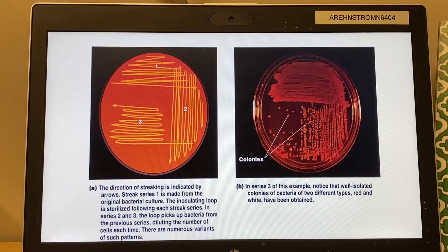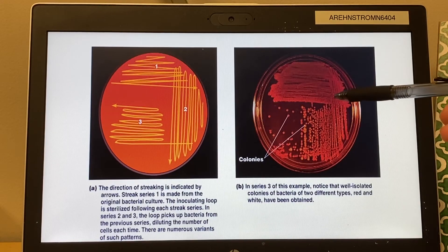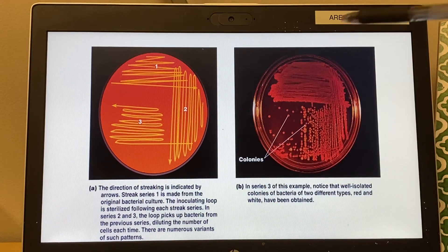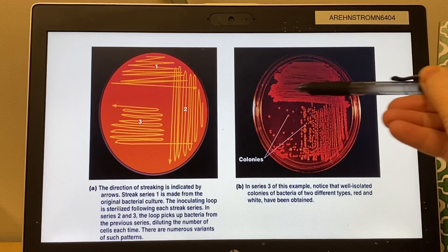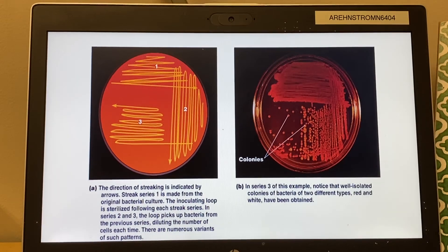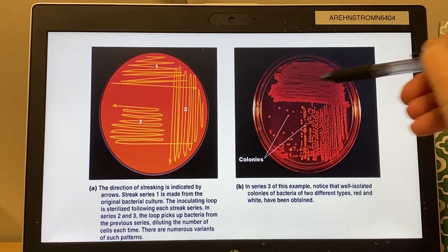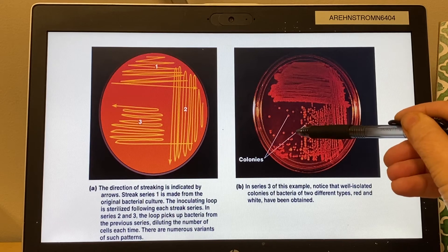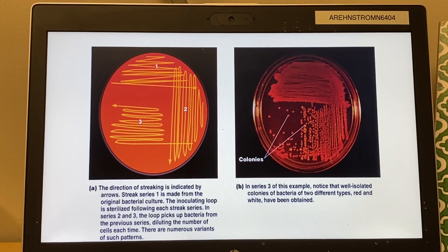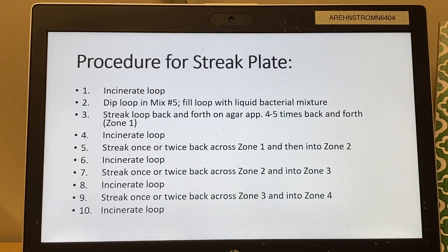Here's an example of a mixture of E. coli and Serratia. In this example they're using just three streaks — we're actually going to use four. It looks reddish-orange and very concentrated; you can't see individual colonies because there are probably hundreds of thousands in there with no room to grow, so it looks like smears of bacteria. When you do the streaking and get over to the final streak, you're going to see individual red colonies and individual tan colonies — that's what you're going for.